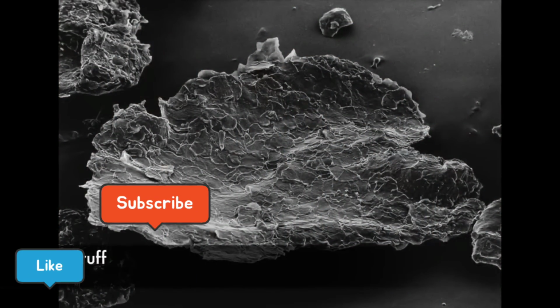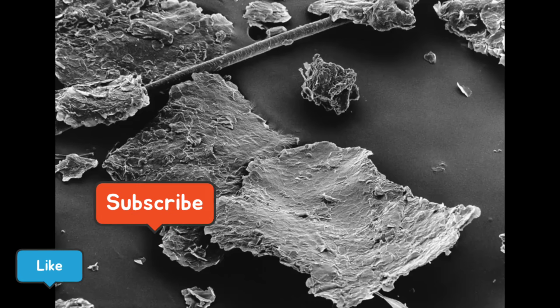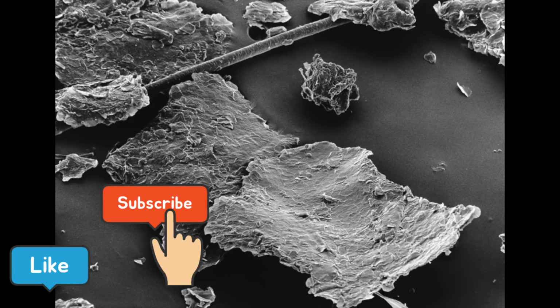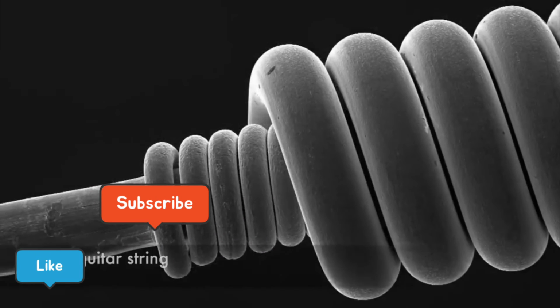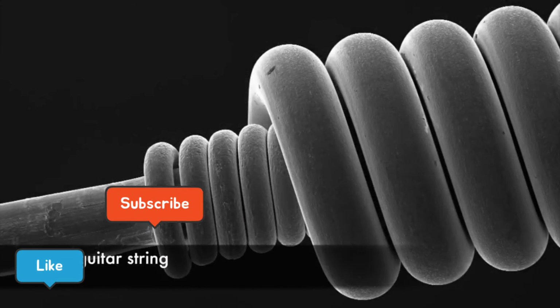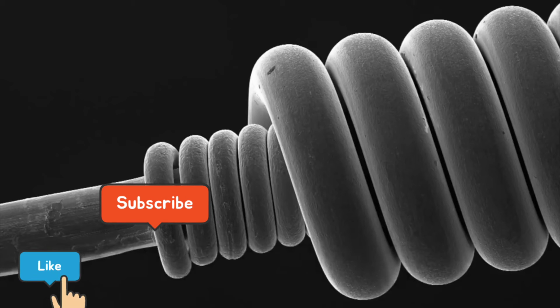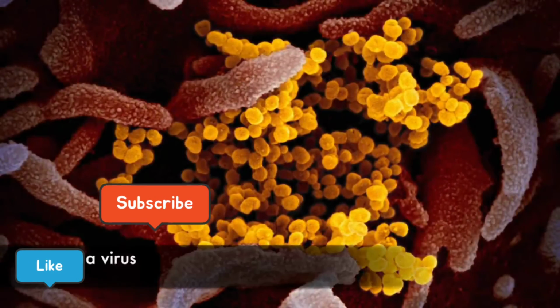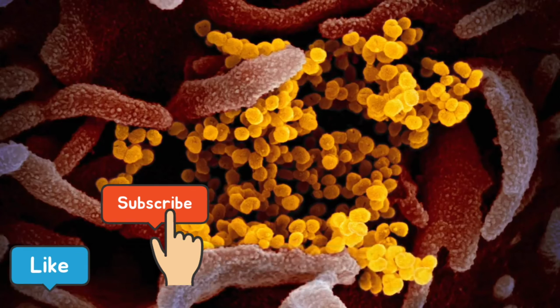This is human dandruff. Dead skin is shed continually from all over the body surface, and scales such as these are a constituent of house dust. They are the staple food of dust mites. A bass guitar string. The novel coronavirus, colored yellow, emerging from the surface of cells.